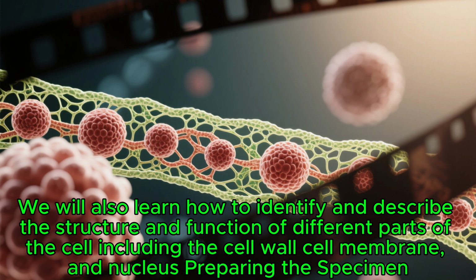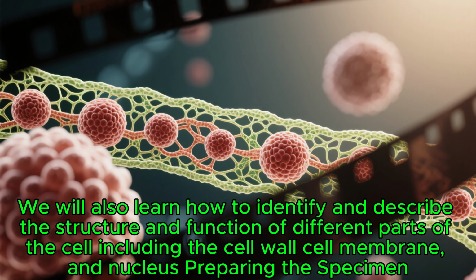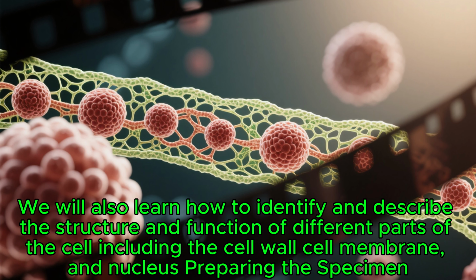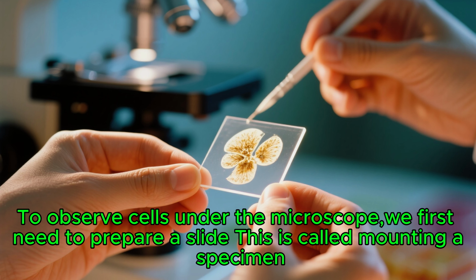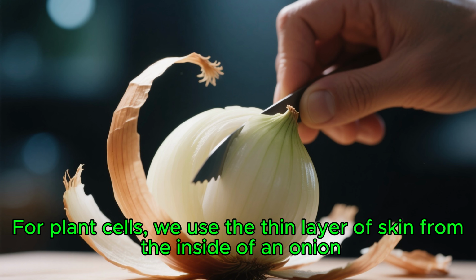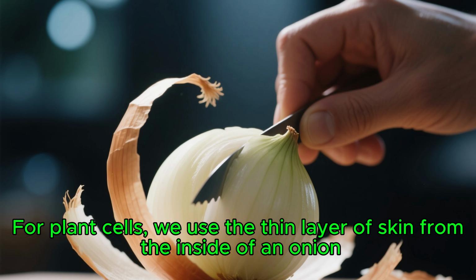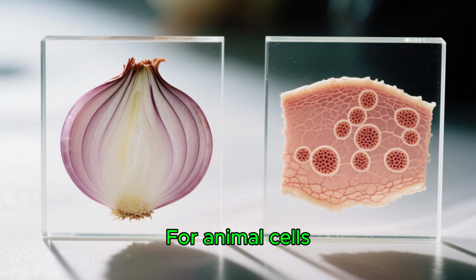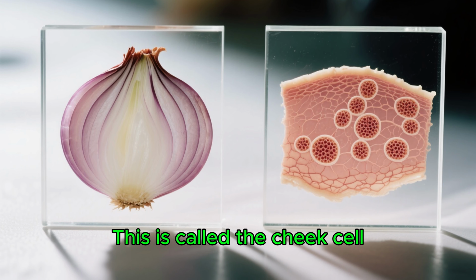We will also learn how to identify and describe the structure and function of different parts of the cell, including the cell wall, cell membrane, and nucleus. Preparing the specimen. To observe cells under the microscope, we first need to prepare a slide. This is called mounting a specimen. For plant cells, we use the thin layer of skin from the inside of an onion. This is called the onion epidermal cell. For animal cells, we can use a small sample from the inside of the cheek. This is called the cheek cell.